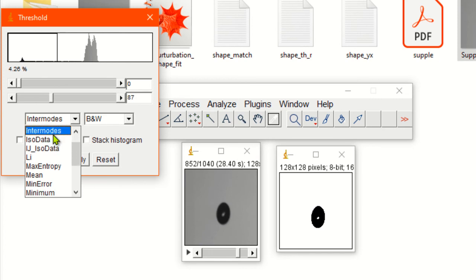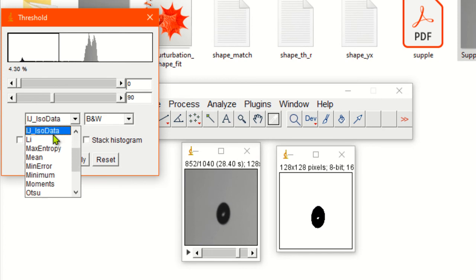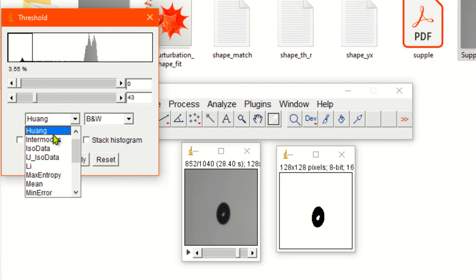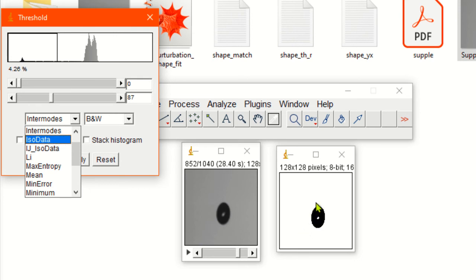Now you can see the image is converted into absolutely black and white background. There are several methods, for example default, Huang, intermodes, isodata, Li. You can select any thresholding method depending on how it looks.